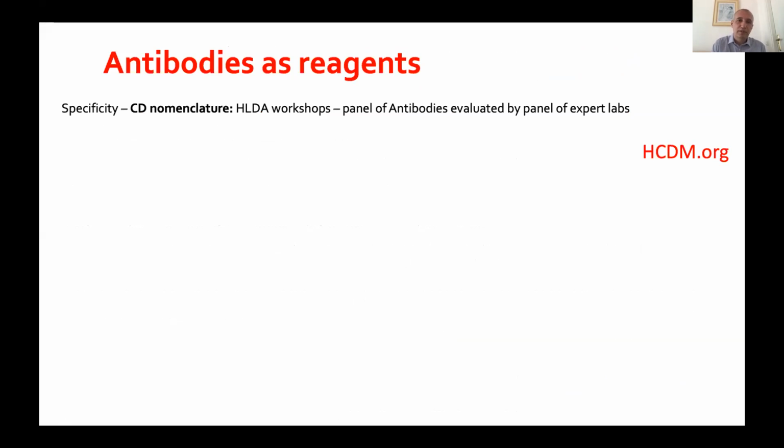This was originally and still is run by HLDA workshops where new clones for new targets are assigned a CD, and these panels of antibodies are evaluated by a panel of experts by wet experiments. The HCDM is the organization that runs those workshops.